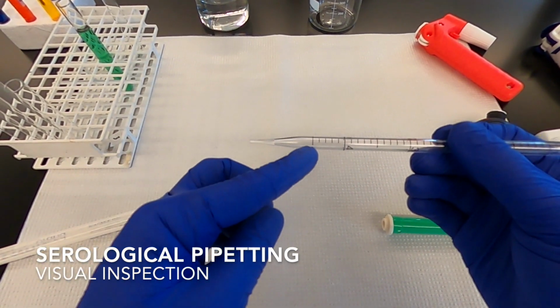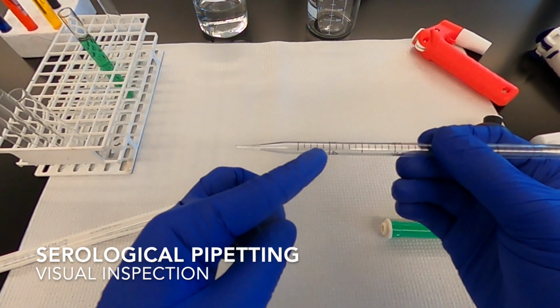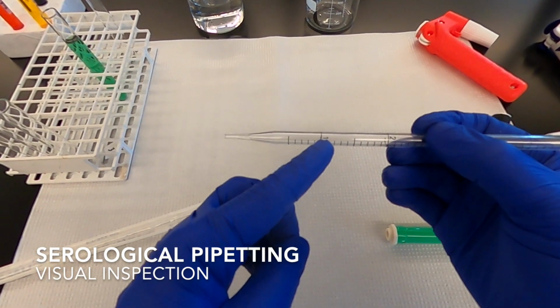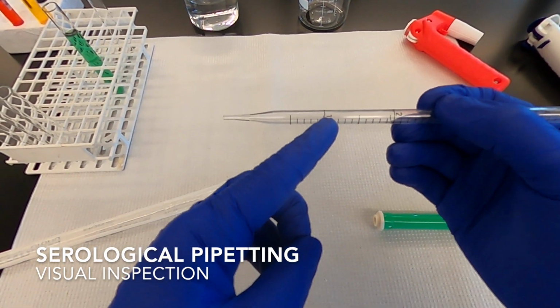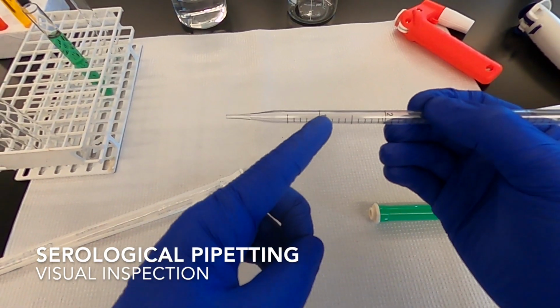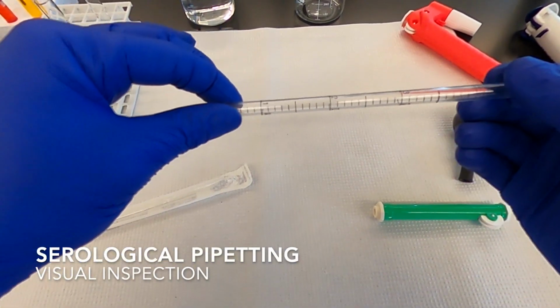Notice that on this pipette, the tip has its own volume included. So from here to here is 0.5 milliliter before the graduation starts. So if I fill up to this line, I have 1 milliliter. That is important because not all pipettes include this tip volume, so you should always check that you are using this kind of pipette before you pipette.